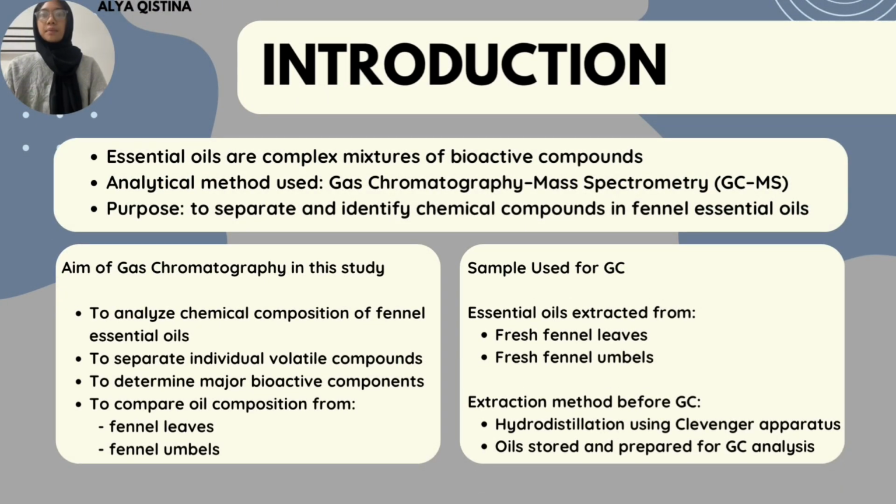Essential oils are complex natural mixtures containing many bioactive chemical compounds. To fully understand their chemical composition, reliable analytical techniques are required. The analytical methods used in this research are gas chromatography, mass spectrometry, Fourier transform infrared spectroscopy, and DFT and MNDO. However, in this presentation, we will focus only on the gas chromatography or GC component.